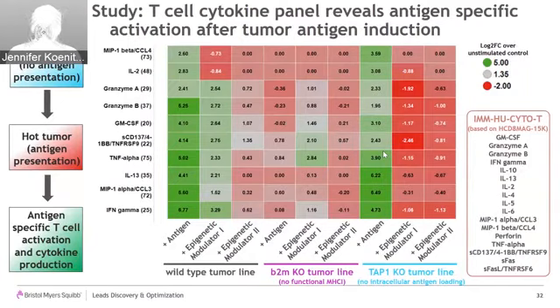So this basically means that the T cells were very, very strongly activated and lysed the tumor cells and proliferated and produced all of those different molecules, including, for example, granzyme or interferon gamma, which are key for mediating T cell effector function.